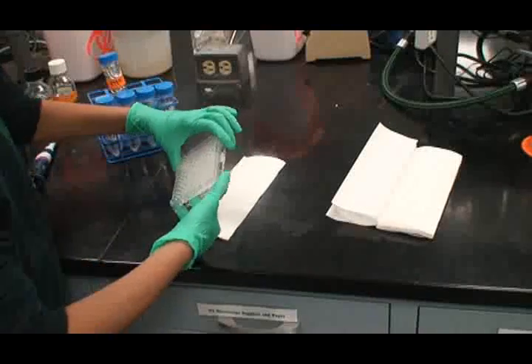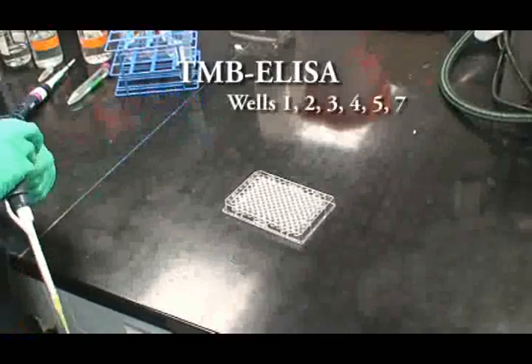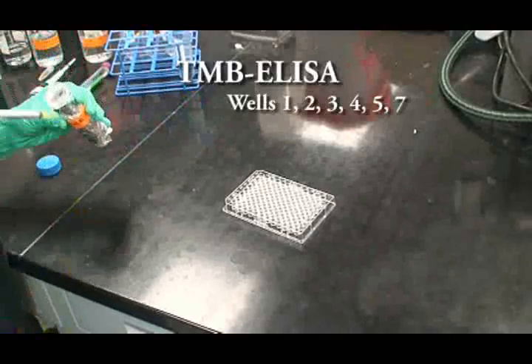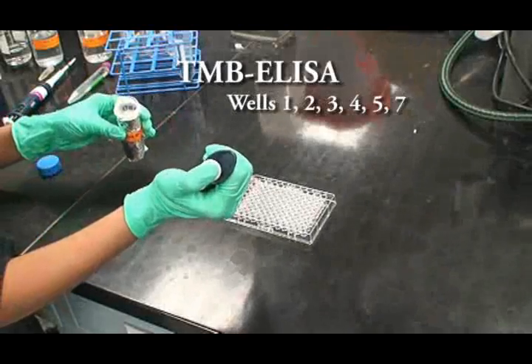Add 150 microliters of TMB ELISA substrate to wells 1, 2, 3, 4, 5, and 7. Add PBS to wells 6 and 8.